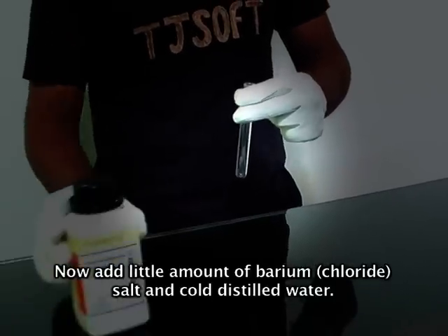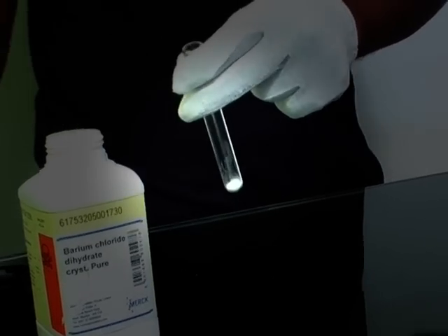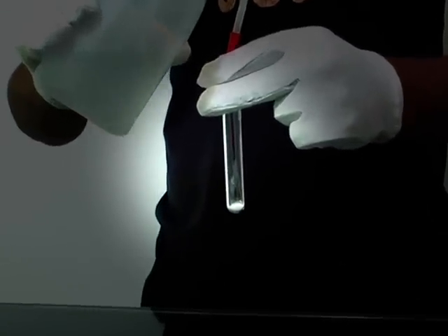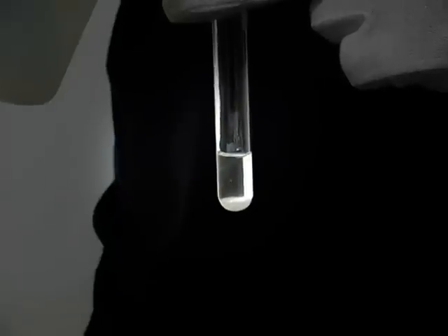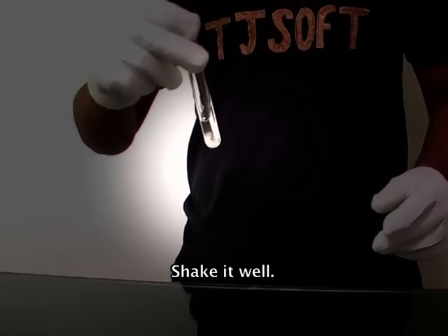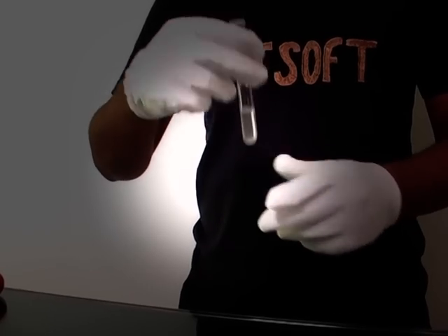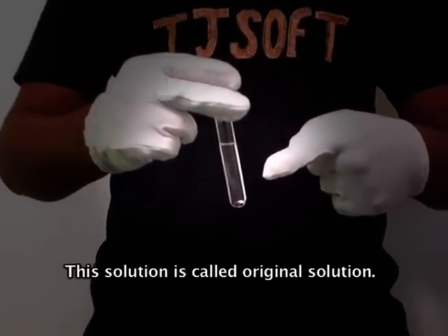Take a test tube. Now add a small amount of barium salt and cold distilled water. Shake it well. This solution is called the original solution.